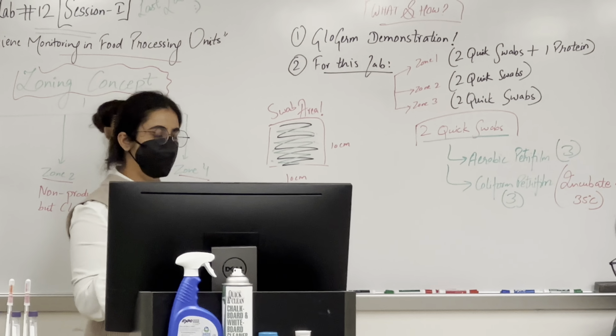Then insert it back and press it. You have to activate this when you come back in the 057 lab, because this takes 10 minutes for the incubation period, and you will read your results after 10 minutes. After you come back from the dairy plant facility, just push it into the device tube.